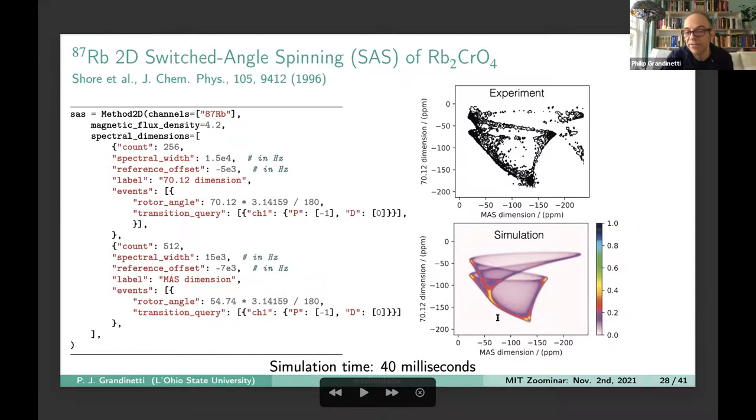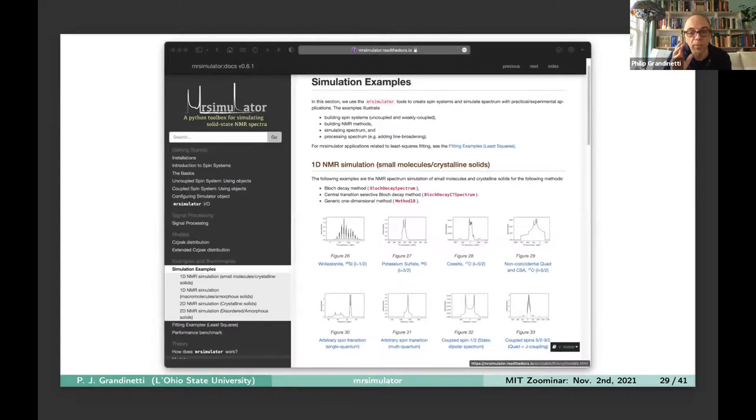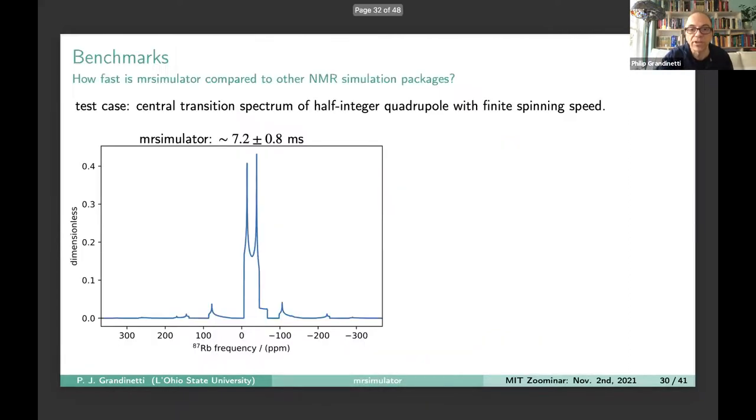And that simulation takes 40 milliseconds, and you can get that really cool looking spectrum that Jay Shore got back in '96. Okay. There are many other examples in the library. If you go to the Read the Docs page, you can scroll through and see various scripts where you can work through these and see how we simulate all kinds of 1D examples. There's a number of 2D examples in there too.